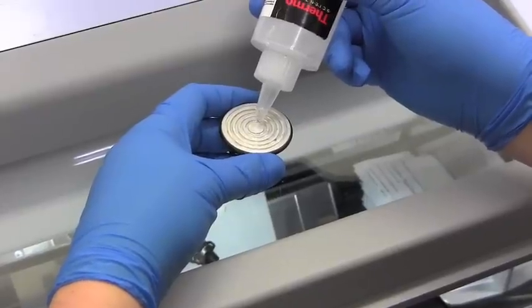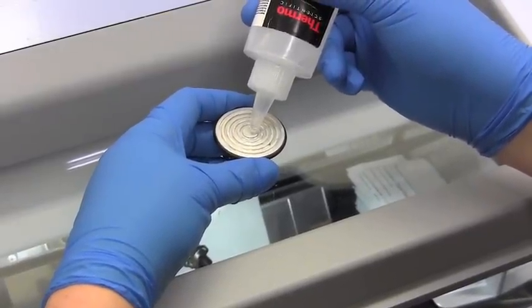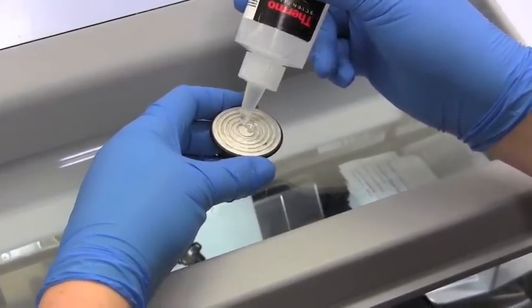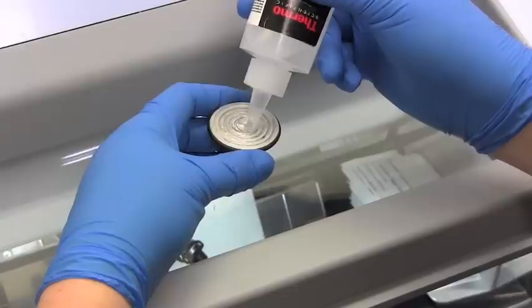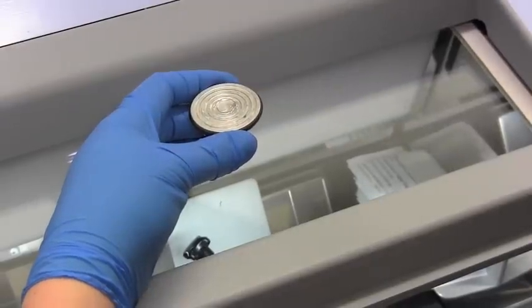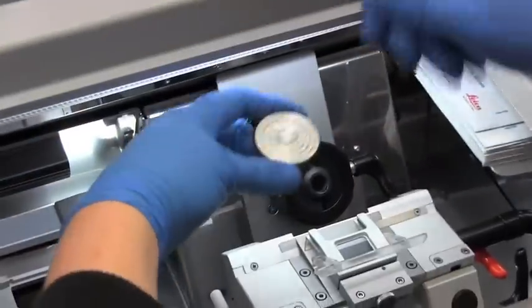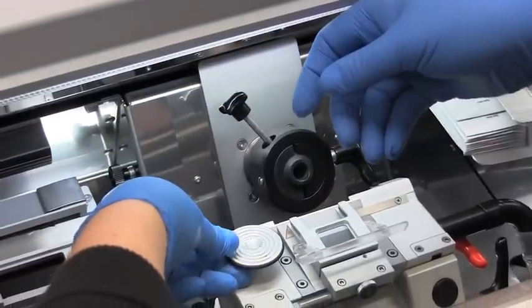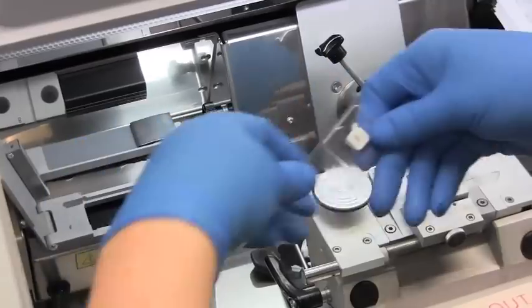To mount your sample, you don't want to have any bubbles in the tip of the cryo matrix because that will make a weaker bond. Put a nice thin layer, and this is room temperature, and then our sample is here.